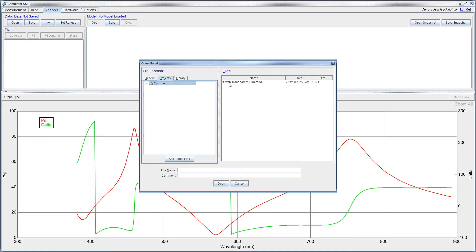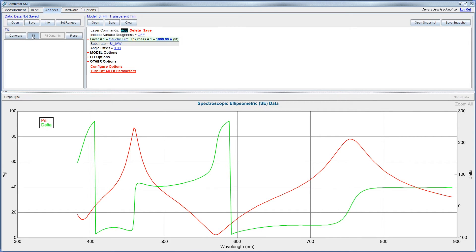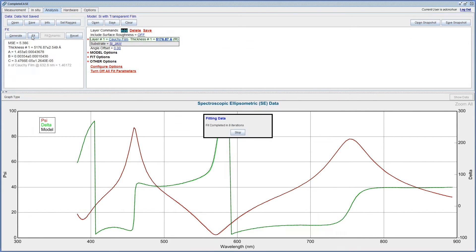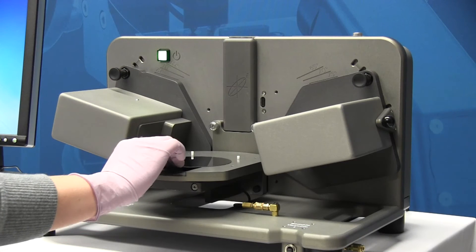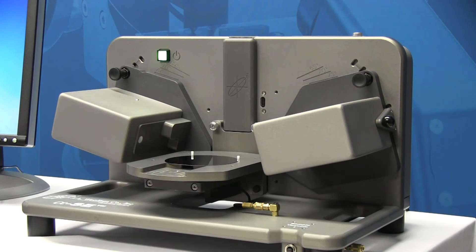Easy-to-use software with push-button operation is included with every system. When you are ready to measure, simply mount your sample.